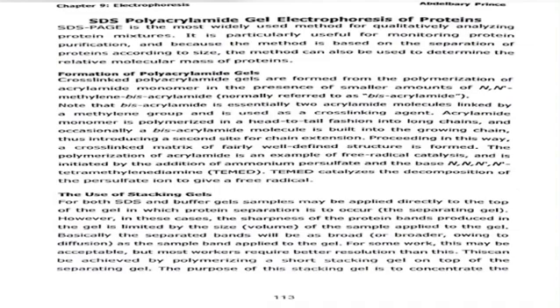The polymerization of acrylamide is an example of free radical catalysis and is initiated by the addition of ammonium persulfate and the base N,N,N',N'-tetramethylethylenediamine (TEMED). TEMED catalyzes the decomposition of the persulfate ion to give a free radical.